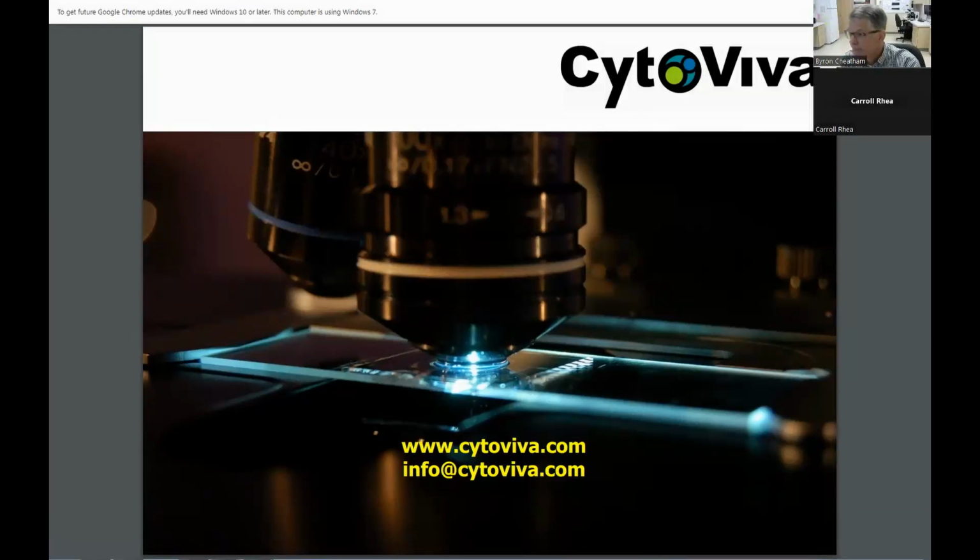Thank you. All right, next, can spectral libraries be imported or exported into the software for pattern recognition purposes? Well, we're using a highly customized version of hyperspectral image analysis software called ENVI. But you can capture hyperspectral images with this. You can port them over into MATLAB. You can use Python, anything that will allow you to do pattern recognition, artificial intelligence, whatever you want to do, you can use this data in these hyperspectral images to conduct any sort of spectral analysis that you want to do.